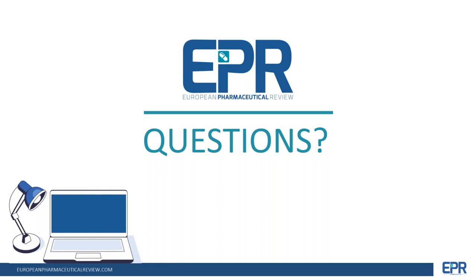Okay, we have just one more question to run through, and that is, how many samples can you analyze per chip? What more information can you provide? So each chip can analyze up to 125 samples. You can certainly analyze a smaller number of samples on one day, and then dry the chip out, and then come back in a few days and reuse that chip. But the maximum number of injection count is 125 per chip. Excellent, thank you very much.